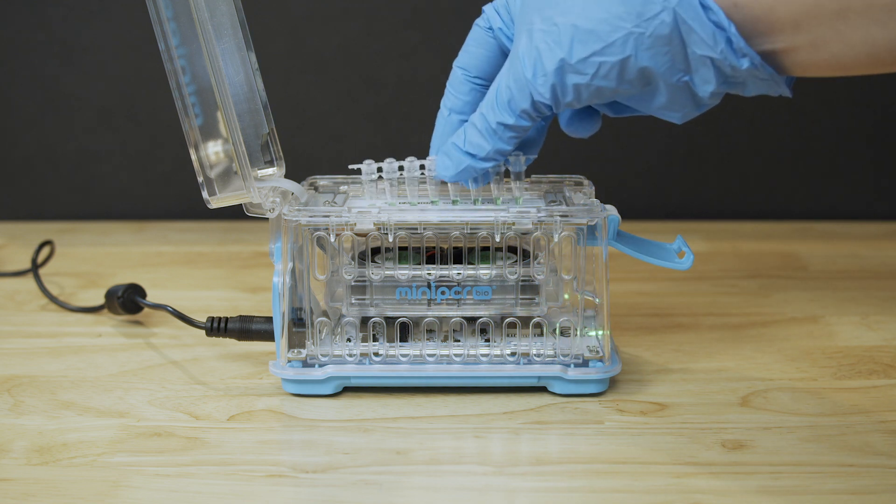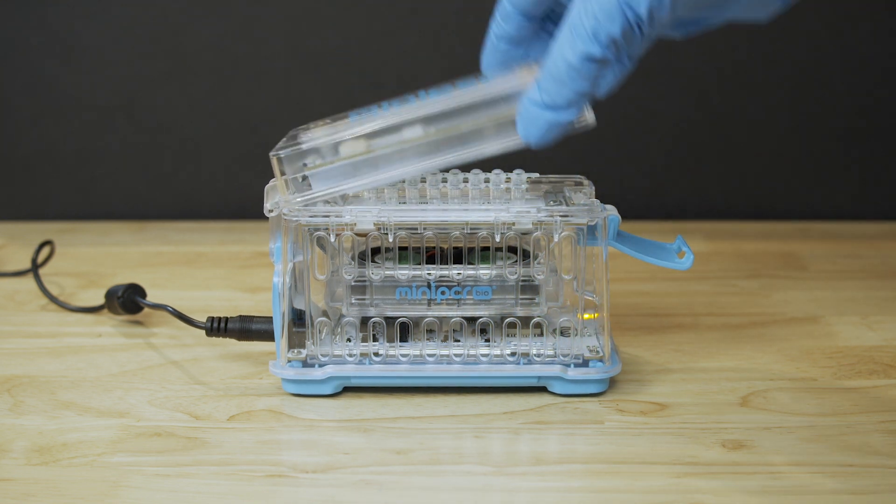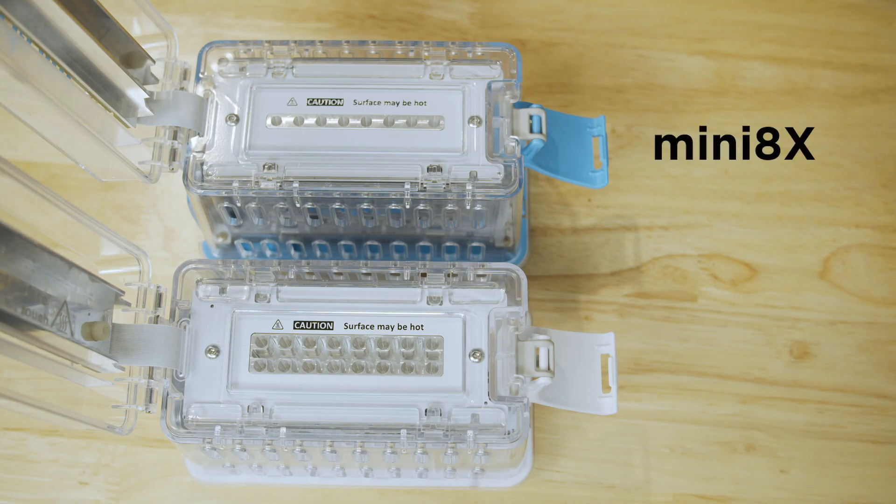Mini-PCR machines are compatible with standard PCR tubes and reagents. The Mini-8X can hold 8 samples at a time, while the Mini-16X can hold 16 samples at a time.